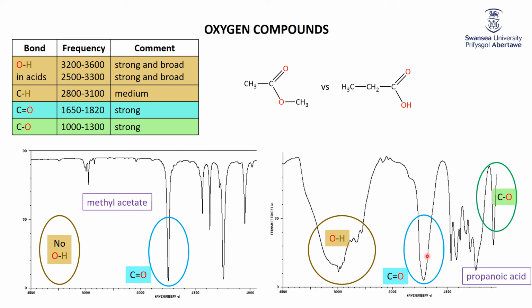Okay, the acid peaks tend to be much broader and yuckier, mainly, as I said, because of that electron delocalization that you can have within the acid that you don't have to anywhere close to the same extent in esters or in, of course, the alcohols that we looked at. And just, of course, to wrap it up, a nice, beautiful CO single bond peak. So there we are, oxygen compounds really based around three potential peaks. Do you have OH? Do you have C double bond O? Do you have C single bond O?